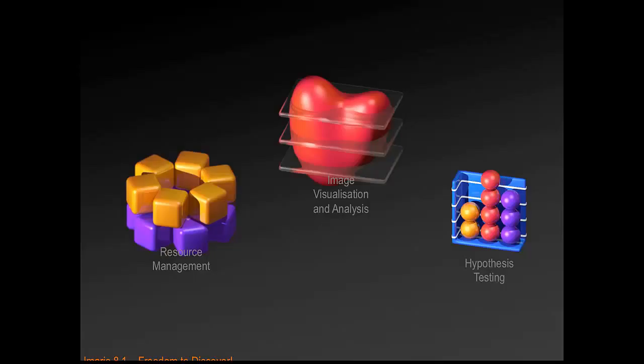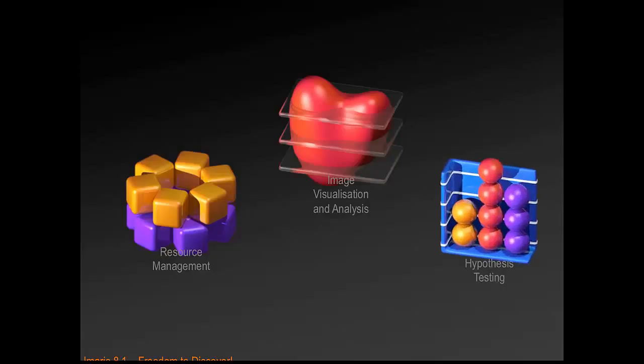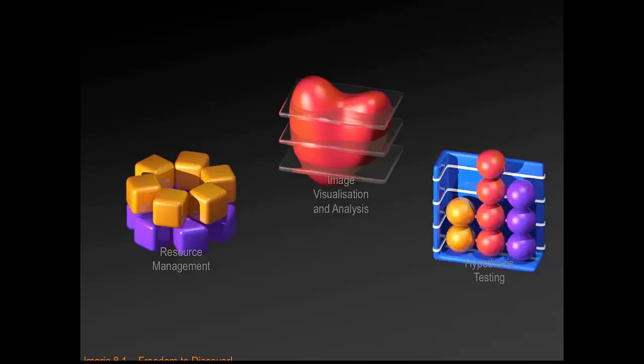And we offer Vantage for you to, for now, visually test your hypothesis. So you can look at these box plots and make up your mind. Are they different enough or they're not different enough? But the way we are progressing is to include some statistical tests directly in Imaris so that you have also a quantitative measure of how different they are, not just visually.